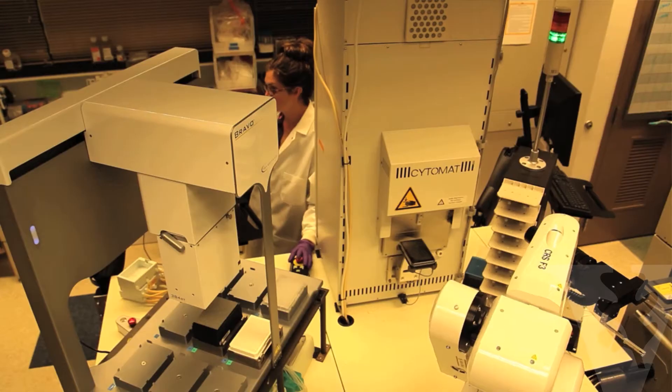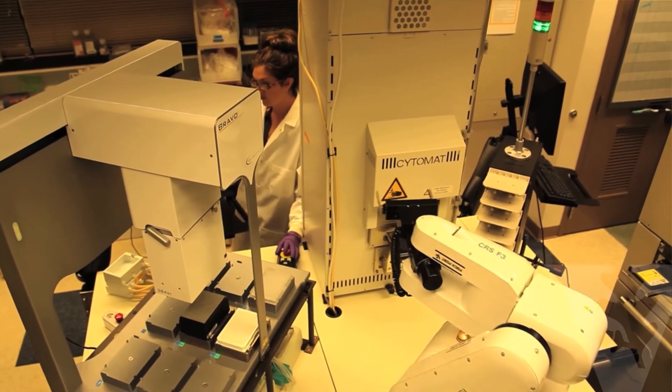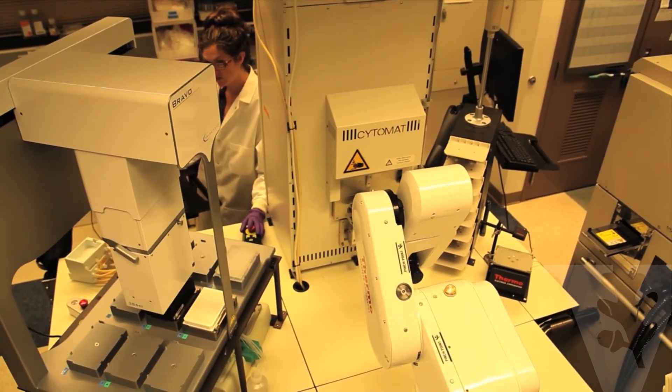The methods we employ ensure reliable and robust experimental performance whether your project calls for a few or hundreds of plates.